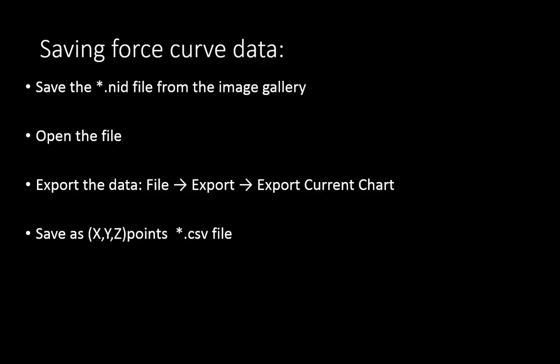You need to save your force curve data in order to process it later. To do this, save the force curve NID file from the image gallery onto your storage. Then open the file from your storage. Go to file, export, export current chart, select XYZ points, and save it as a .CSV file, which you can later open with Excel and process it into a force distance curve.